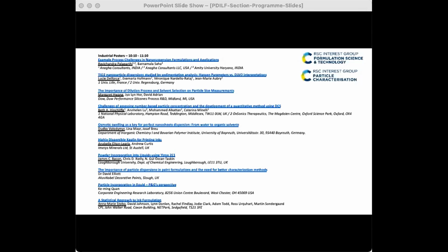Sometimes in the industry we have patents, so we need to look at other technologies, and we find that other amines actually work really well from literature and from work we've done in the past, confirmed here. So it's nice to know and to understand the technology. I'm not presenting everything here, but there are various techniques to check how the amine attaches to the clay, like Hammett indicator, and that's really useful to understand that we're putting the right amount, the right treatment.